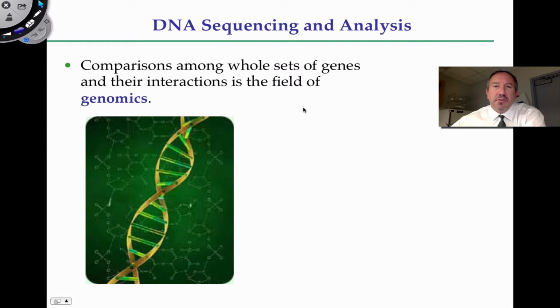And so this particular video is a brief, introductory look at basic Sanger sequencing, which has been the type of sequencing we've been using in biotechnology for the past 30 years. Then it's going to briefly look at next-generation sequencing, what we're currently using, although there's a little bit of an overlap. But in the last 10 years, next-gen sequencing has really revolutionized how DNA sequencing occurs. Hopefully you'll enjoy it and learn something about sequencing.